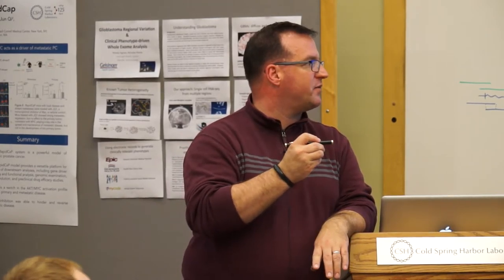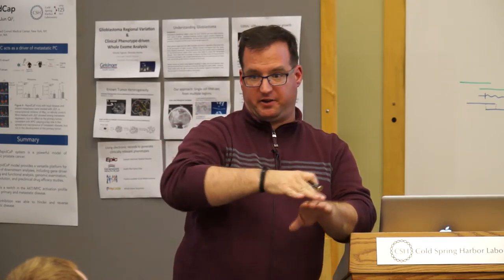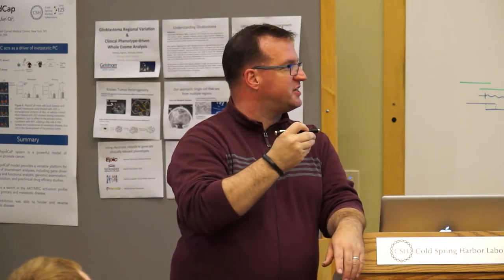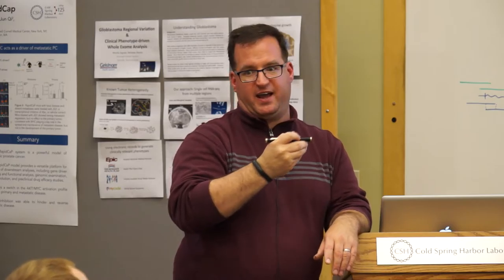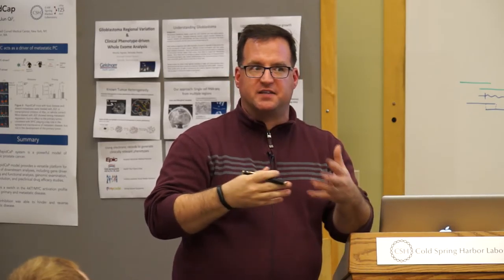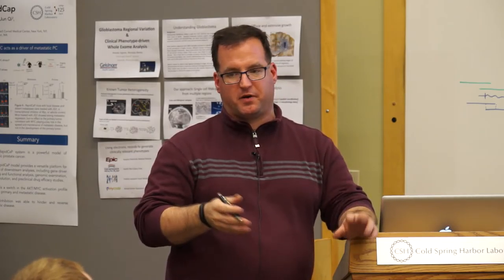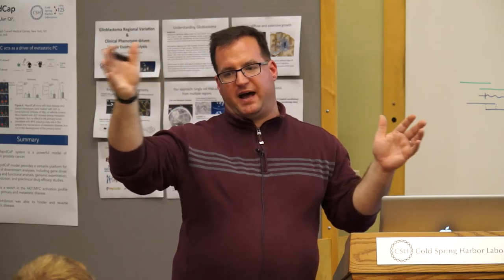Is there still a homopolymer problem with this? Still a homopolymer problem, exactly. Not quite as bad, because it turns out that when you measure pH flux, with light you just get a burst of light. You saw in the flowgram, it was just a constant metric of light. With the pH, you actually get a trace. There's a spike, and then there's a decay, and the decay provides a little bit more information. A little bit. So yes, it does still have a homopolymer problem. Instead of things getting bad at 5 or 6, maybe it gets bad at 8 or 9.